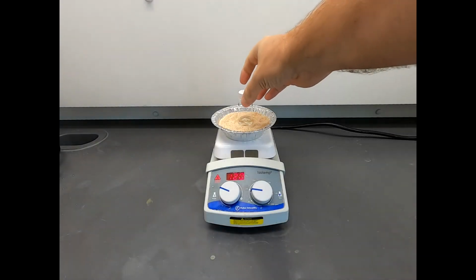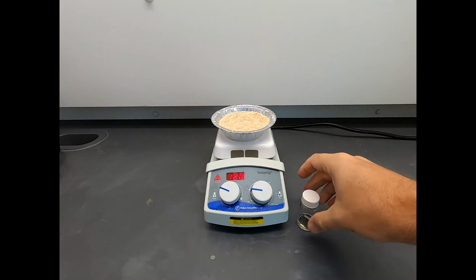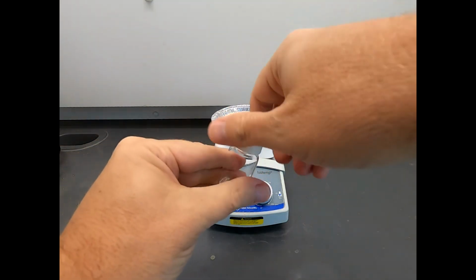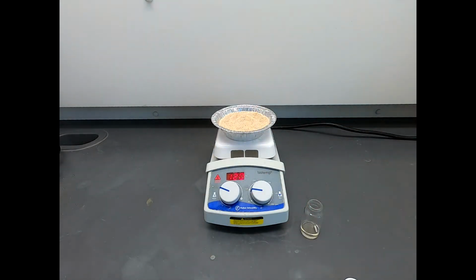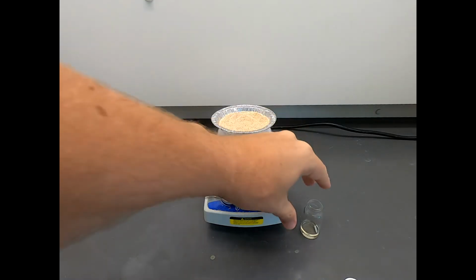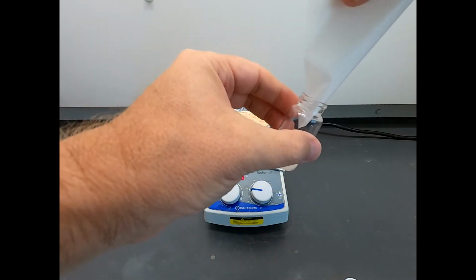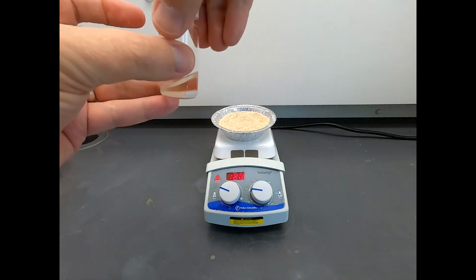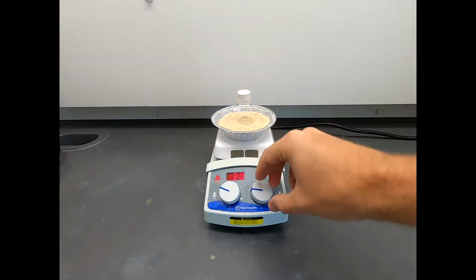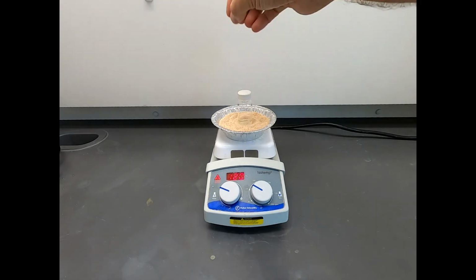It's now been just a few minutes and everything in here is dissolved. This is a nice homogeneous solution. So I'm going to, let's open this up. And that's just barely above room temperature, just very gently warmed. Now I'm going to take the cycloadduct that we weighed out. Add that in, that looks good. Now that's in the mixture. Gently cap, let's get that stirring, let that mix in. And again, these threads are engaged, but they're not clamped down.